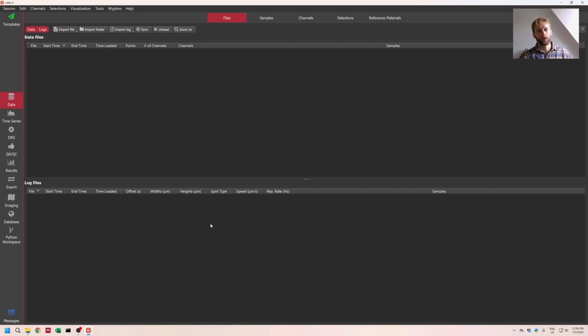And you should go and play around with the settings on Iolite more widely to figure out what it can do for you. So today we're going to do a quick test Iolite file. I'm not going to be reducing real sample data, but it will show you the basics of how to do everything.